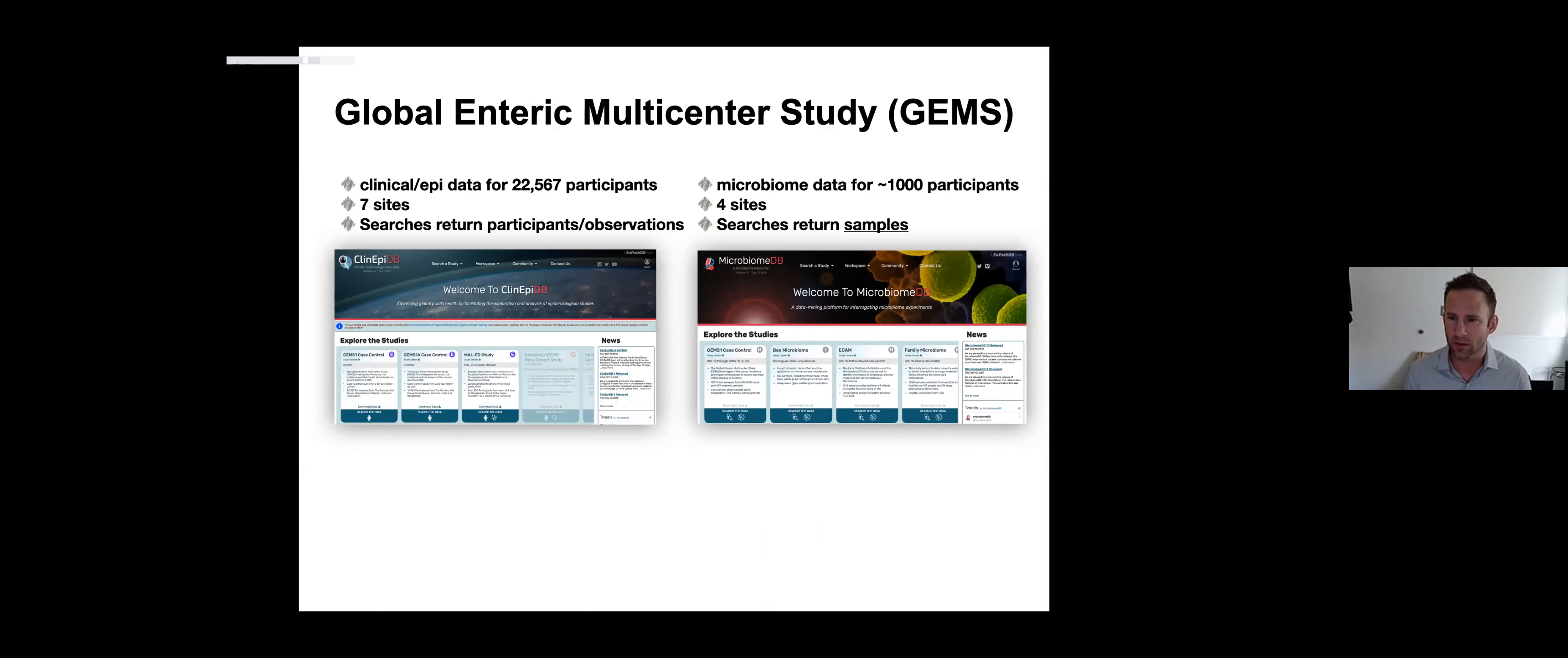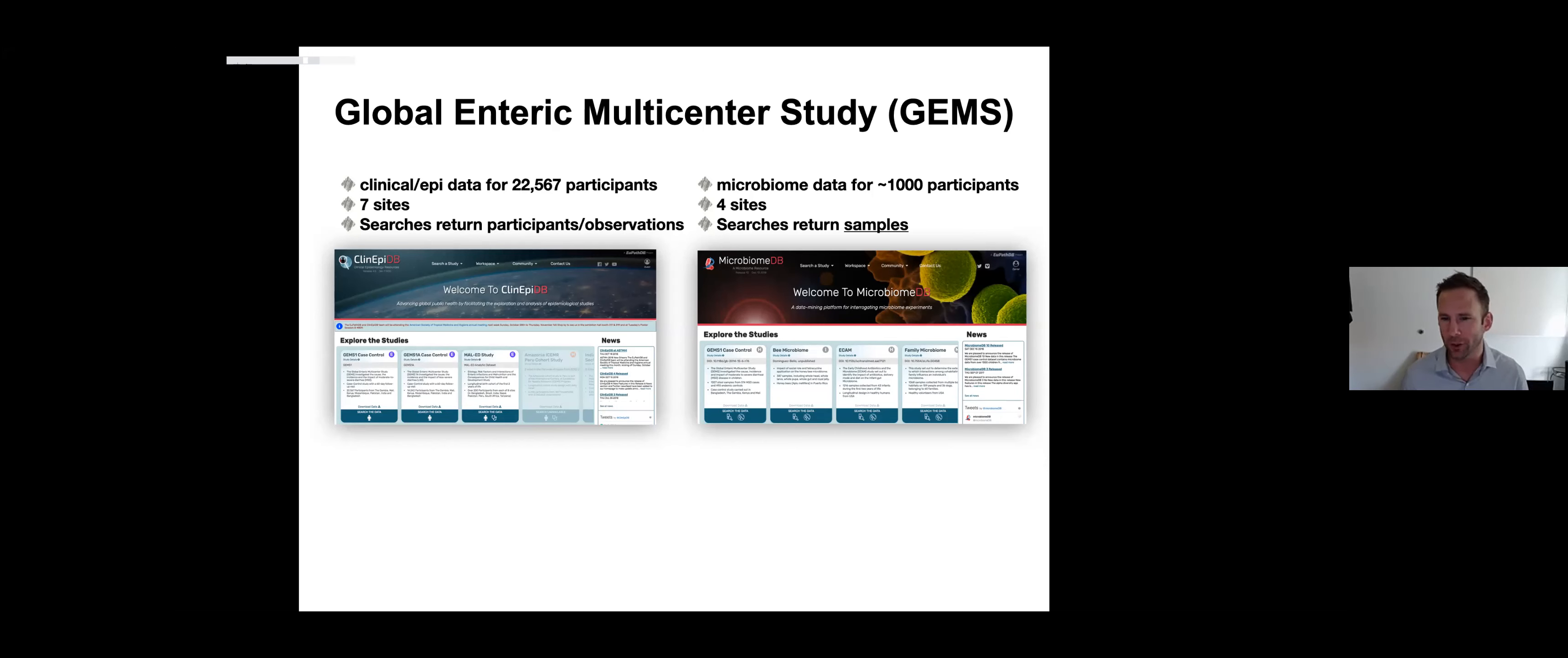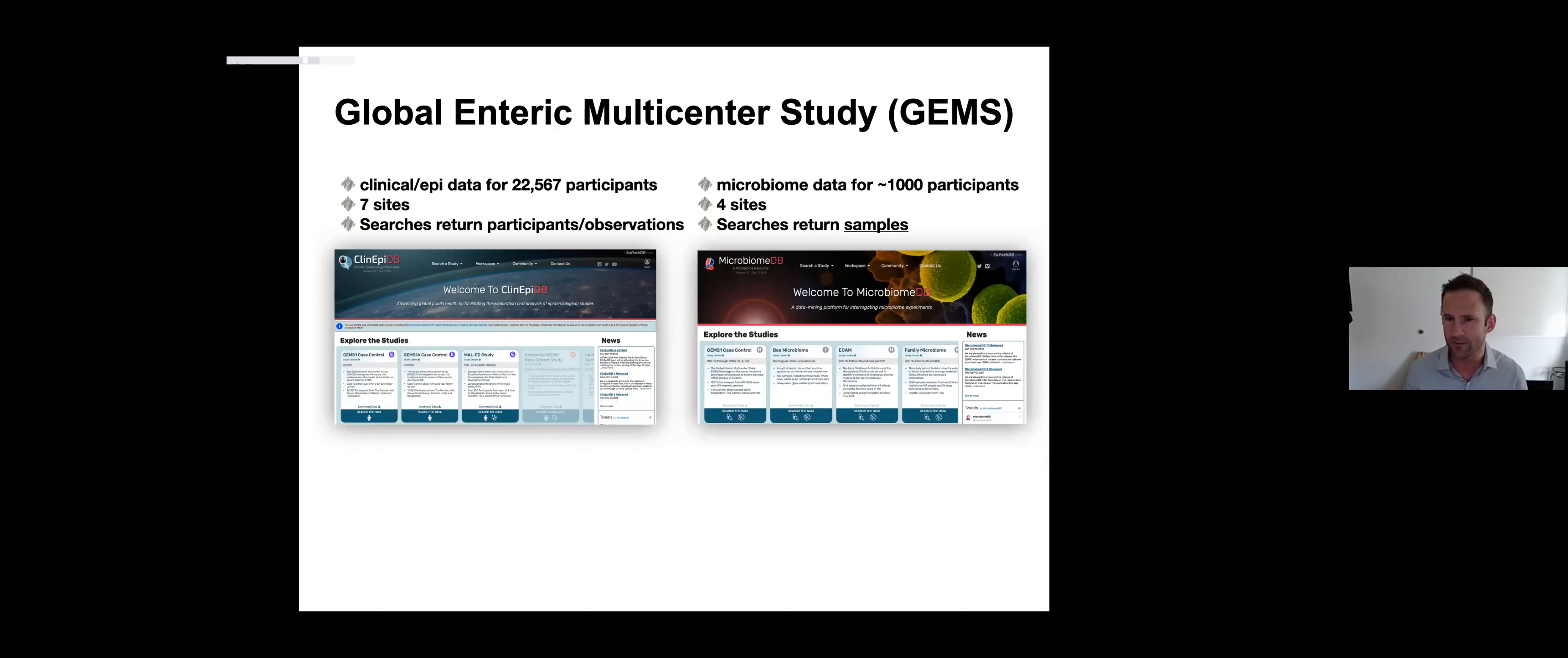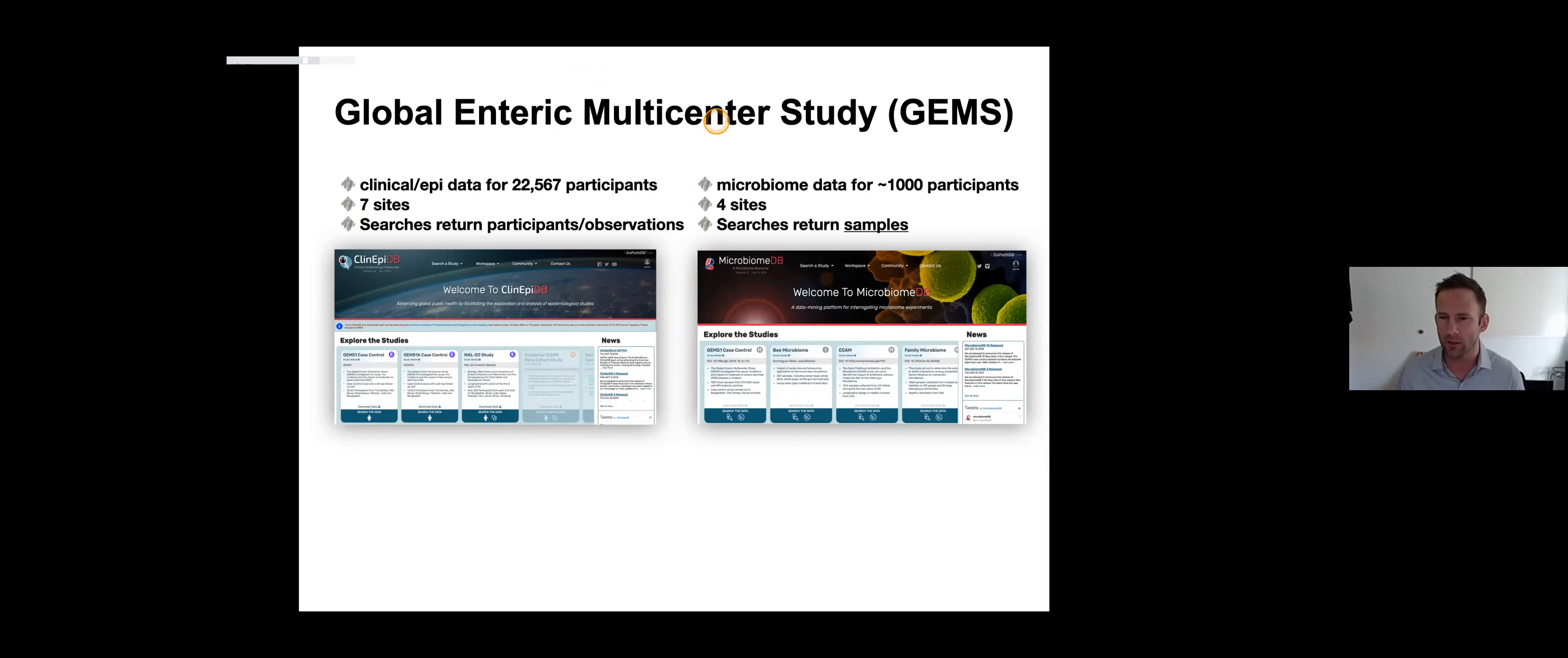This is a screenshot of the landing page for ClinEpi, right next to the same screenshot from MicrobiomeDB. You don't have to look very close to see a lot of similarities in the aesthetics or the user interface. These similarities go further than just look and feel. As an example, for the global enteric multicenter study, the GEMS study that we've already been talking about, ClinEpi has data for over 22,000 participants.